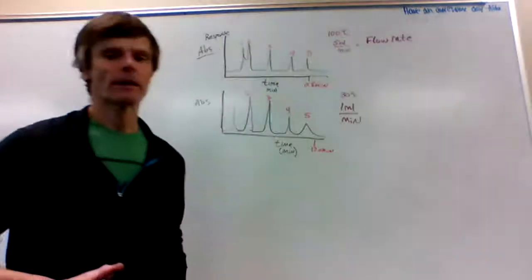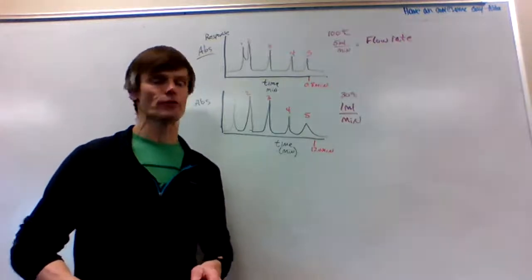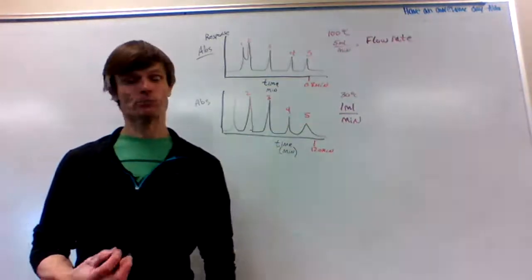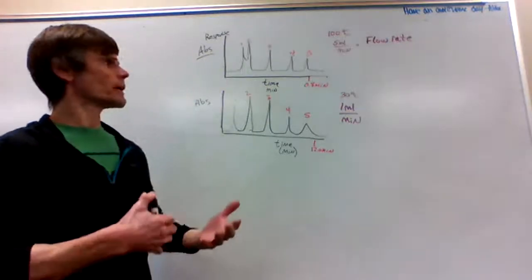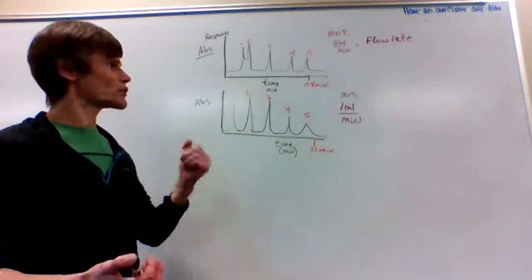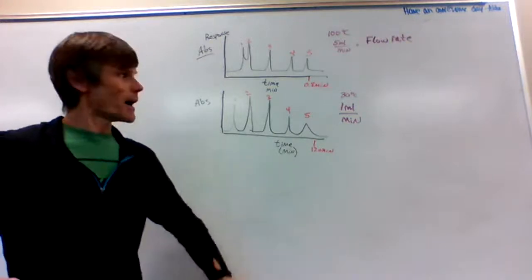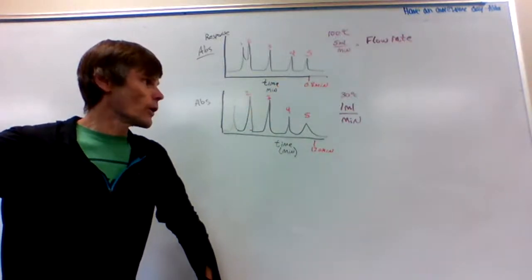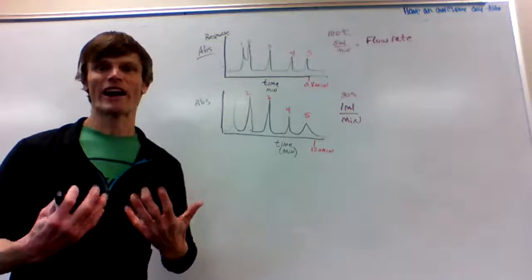That's one bad thing. But probably the thing that's going to hurt your boss the most, if you're working in grad school, is that this experiment took less than a minute. That's 0.8 minutes. It's pretty quick. This one took 12 minutes. We've more than increased our analysis time by a factor of 10. So if we have to do 20 samples and each of them takes 10 minutes, that's going to take some time. Whereas with the faster situation, we're going to be able to do those samples a lot quicker. So this is giving us better resolution, but at a cost. The cost is more analysis time.